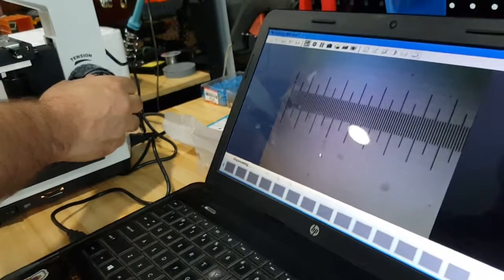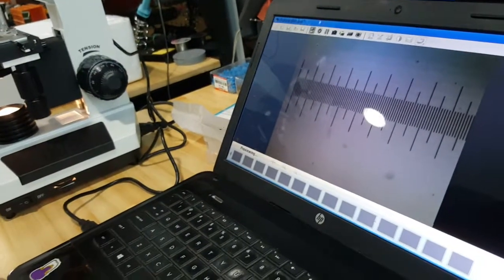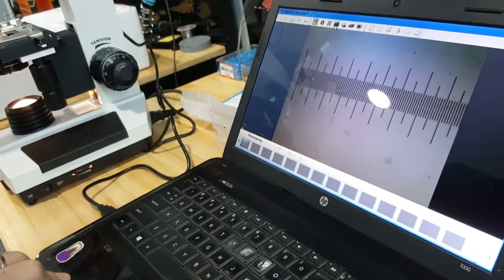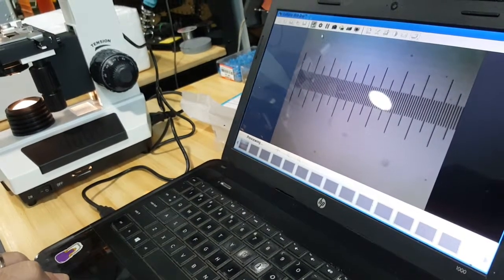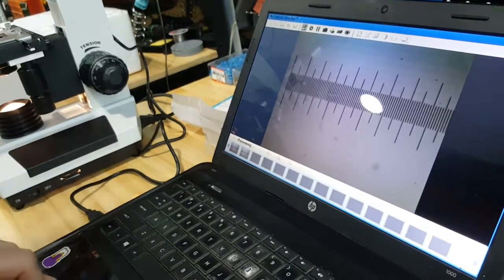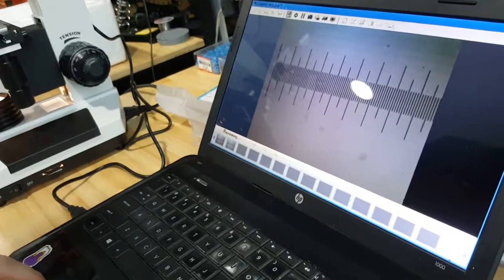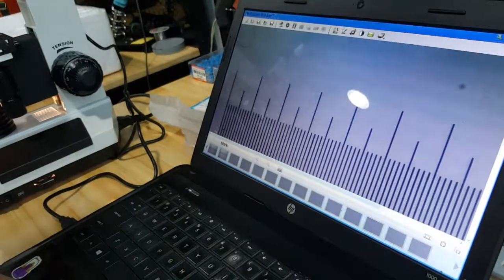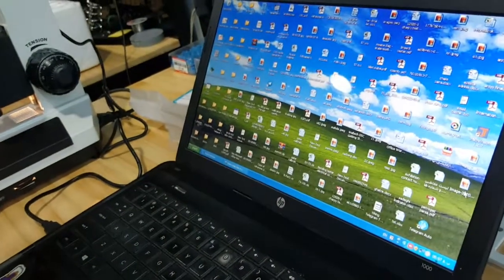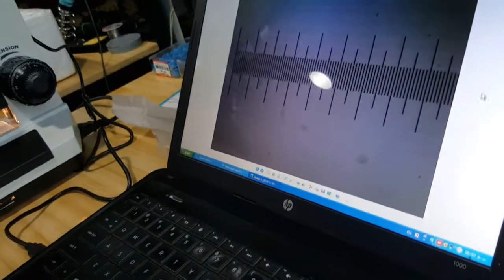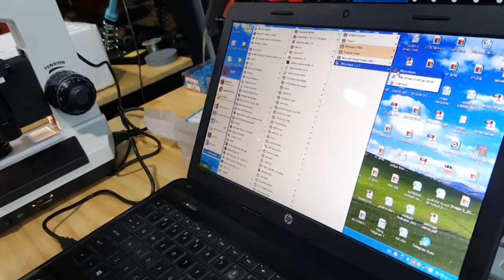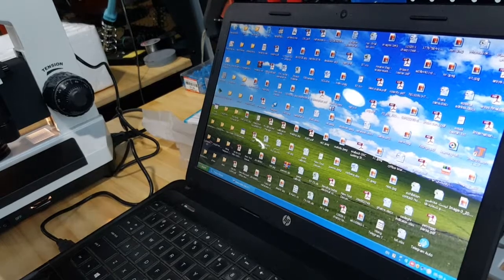You will do this calibration process only one time. I'm taking a picture now. Picture captured — done. Going to the J Micro Vision software, we have the picture here, and I will be using this picture for calibration of J Micro Vision.